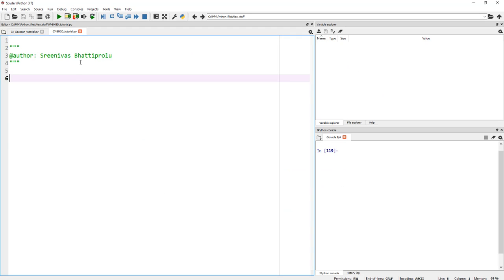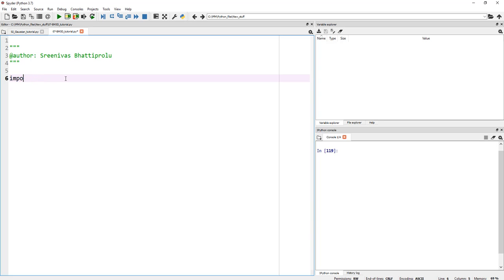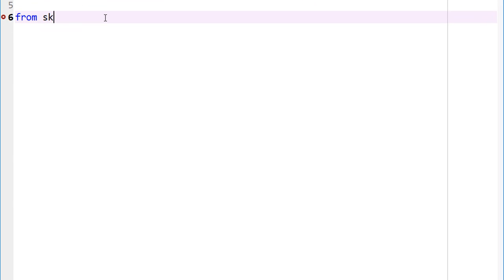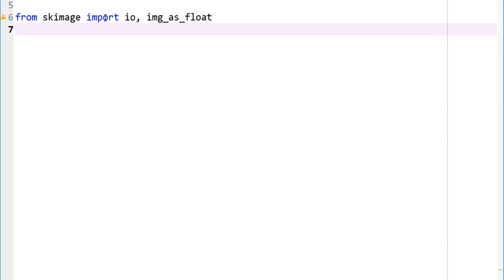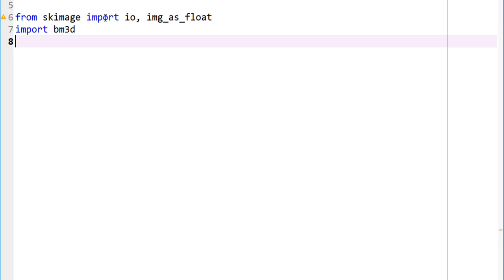Now let's get to our Spyder IDE so we can code a couple of lines to implement this block matching and 3D filtering. First, let's import specific functions. From skimage, import io because that's what we'd be using to read our images, and also let's convert images as float, img_as_float. Let's also import BM3D. I've already pip installed it; if not, go ahead and pip install BM3D.